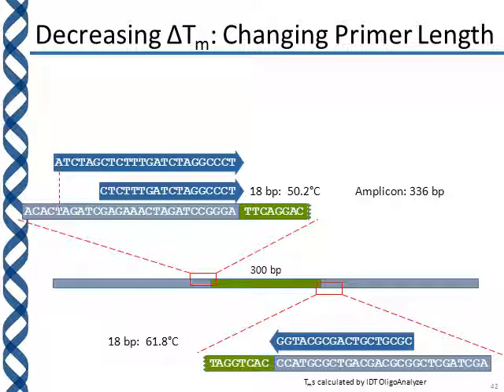So if we were to extend the length of the primer a little bit further back, so you see this newest version of the primer sits in exactly the same 18 base pairs, but just extends back a little bit further. So with those additional nucleotides, once you take those into account, the length of the primer is now 24 base pairs, and because we have additional hydrogen bonds as a result of the increased length, now the TM of that is 56.3.